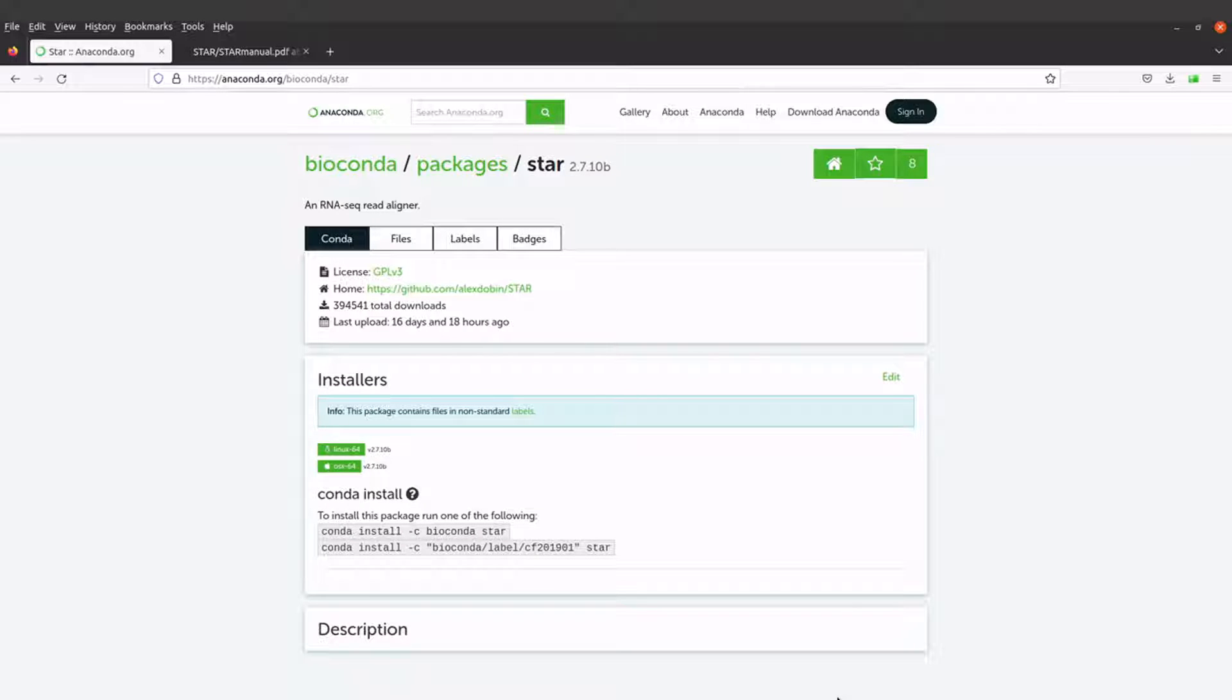In today's video, I am going to show you how you can use Anaconda to install the tool STAR on aligners on macOS system.